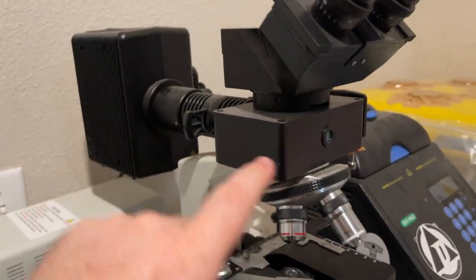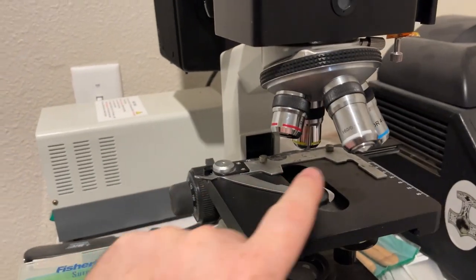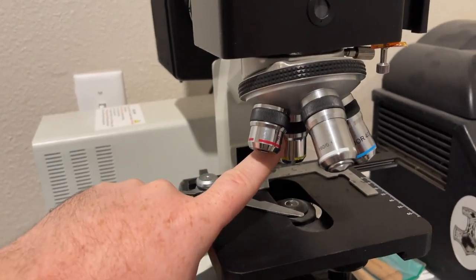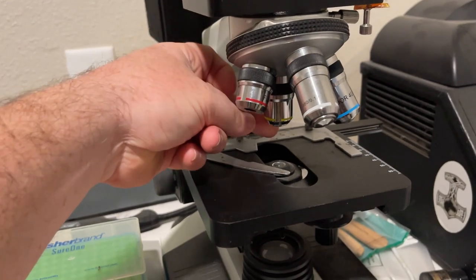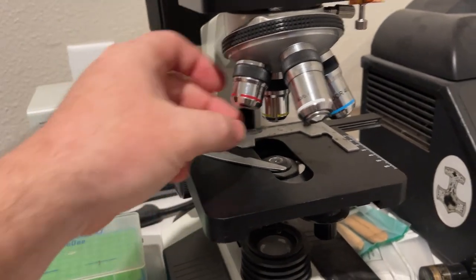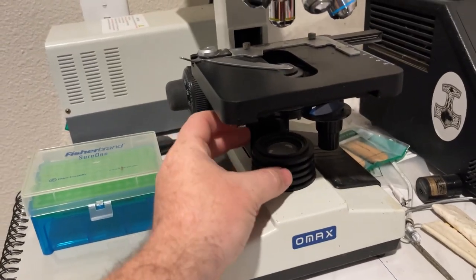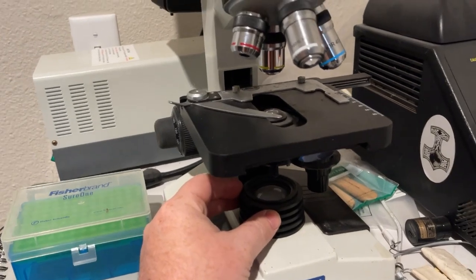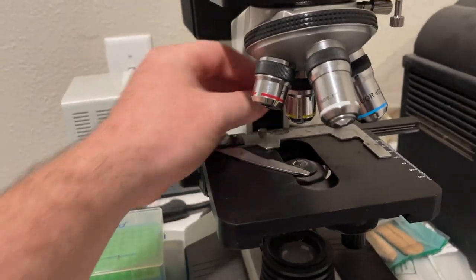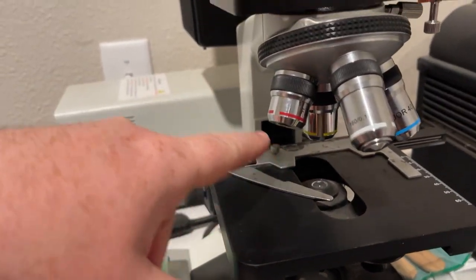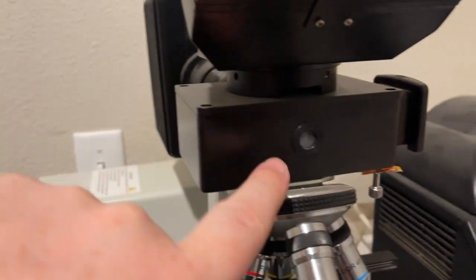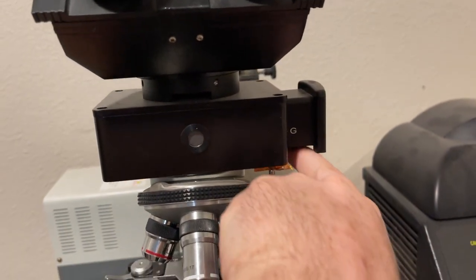UV light comes through here, goes through here. It actually goes through this piece, straight through the optics, into here, and then you get another light source here. The UV light comes through, hits the sample, bounces back off the sample, goes up, gets split here and filtered inside this thing.